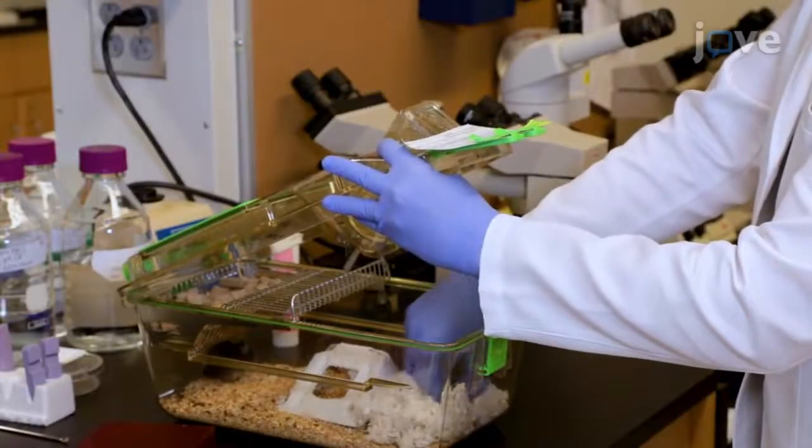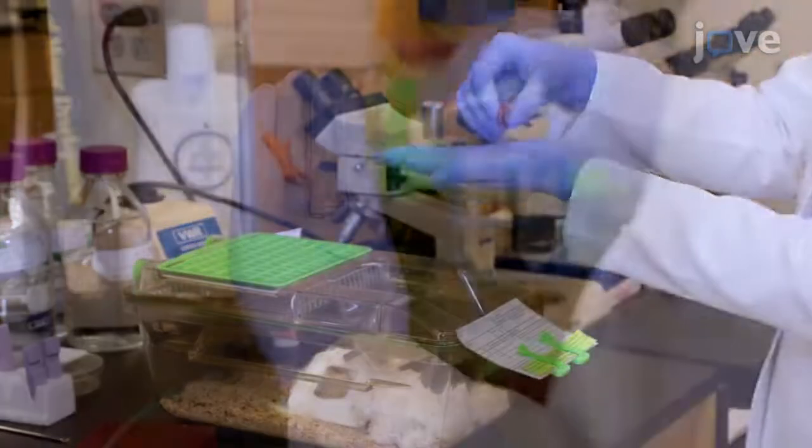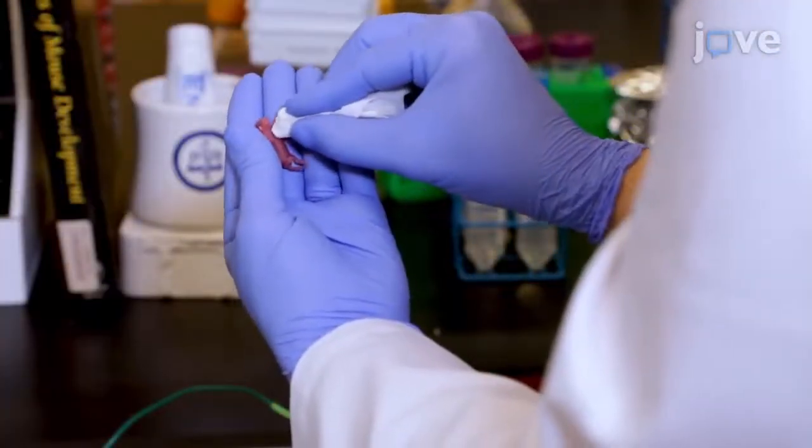After about 15 minutes, remove a mouse pup from its home cage and wipe the thorax with 70% ethanol.